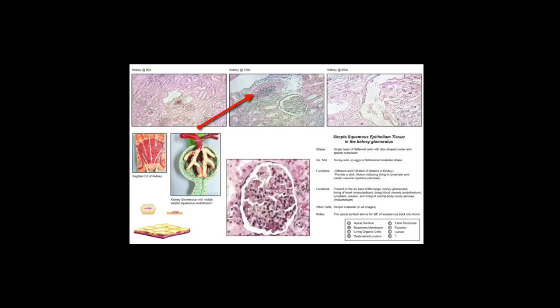We can see a nice blood vessel, and that blood vessel would contain a number of blood cells surrounding it, areolar connective tissue, and that would be binding the tissue we've previously described with the glomeruli and the cuboidal lined tubules surrounding it. This vessel would be located in the kidney as between those two portions.